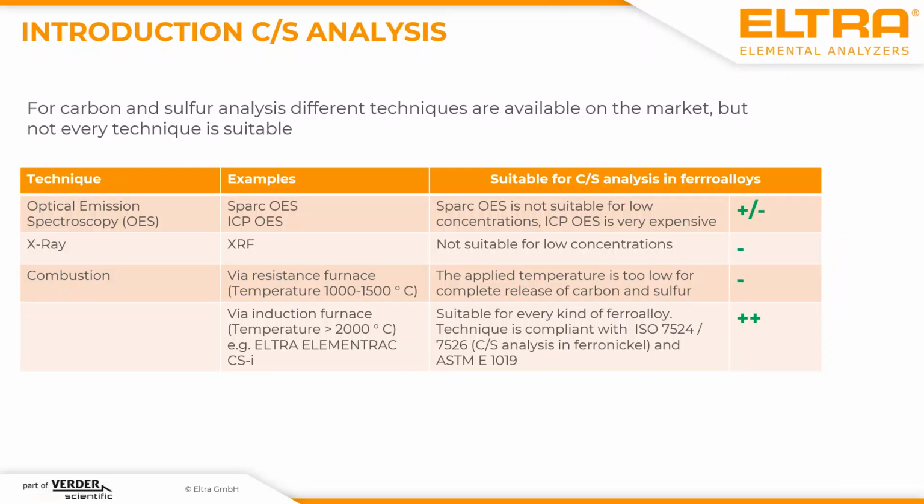It's also the same with X-ray, because you can measure very high concentrations of carbon and sulfur, but when they are present as a trace, it's not possible.